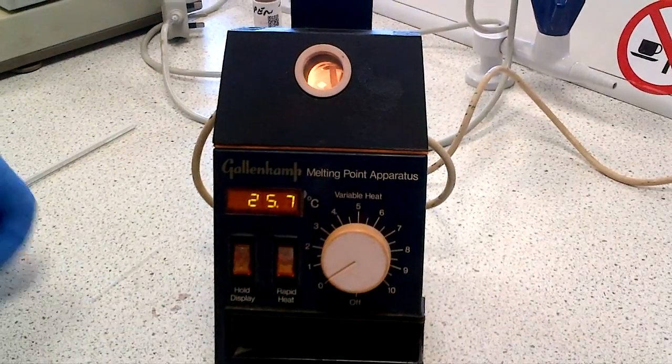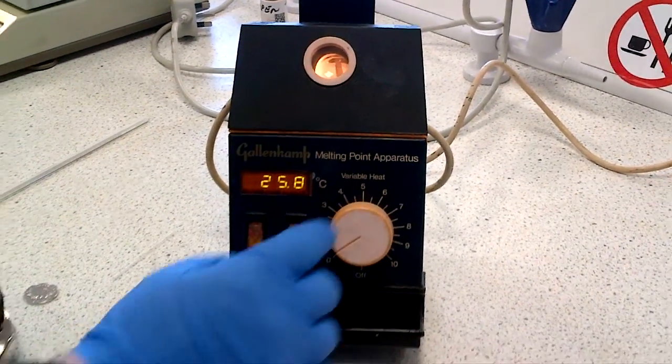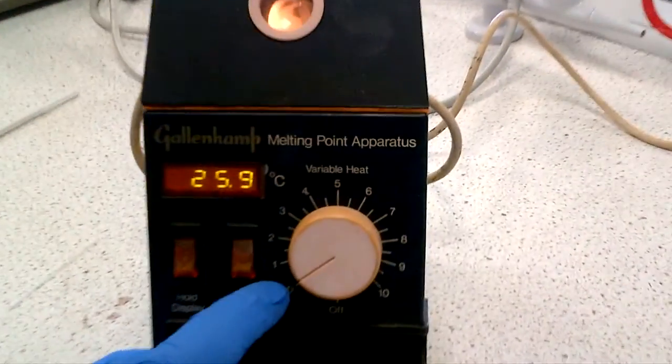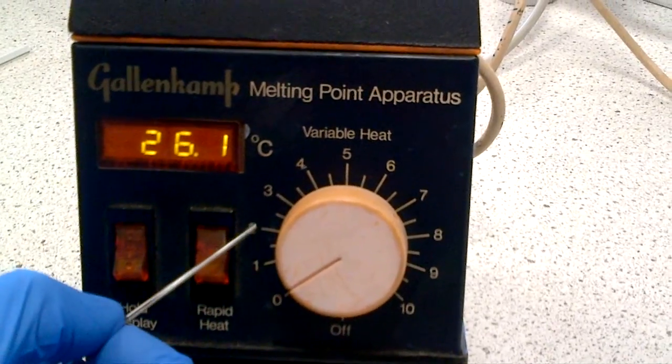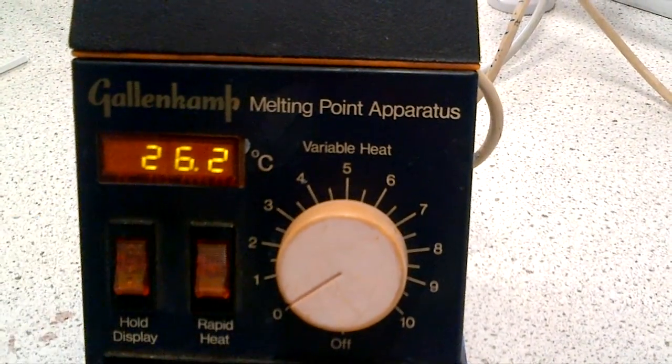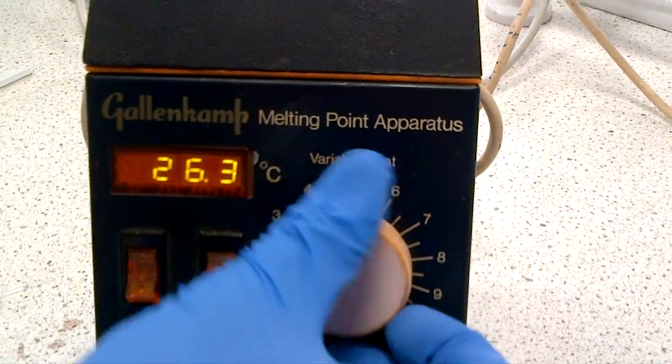And just to say, all melting point apparatus here at Salford are between 0 and 9, and each unit is about 30 to 40 degrees worth of energy, so 30 degrees C, 60, 90, 120, 150, up to about 270, 300.